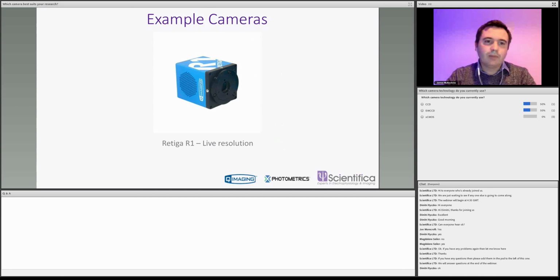You have a CCD camera, which actually runs at, again, 30 frames per second, or a bit slower, 24 frames per second, I think it is. But live field of view, live temporal resolution, but also a reasonable sensitivity. Slightly larger pixels than the Bolt, which again, if you're looking for fluorescence imaging, you want to start to make these compromises by, well, do we go for very small pixels against very large pixels?